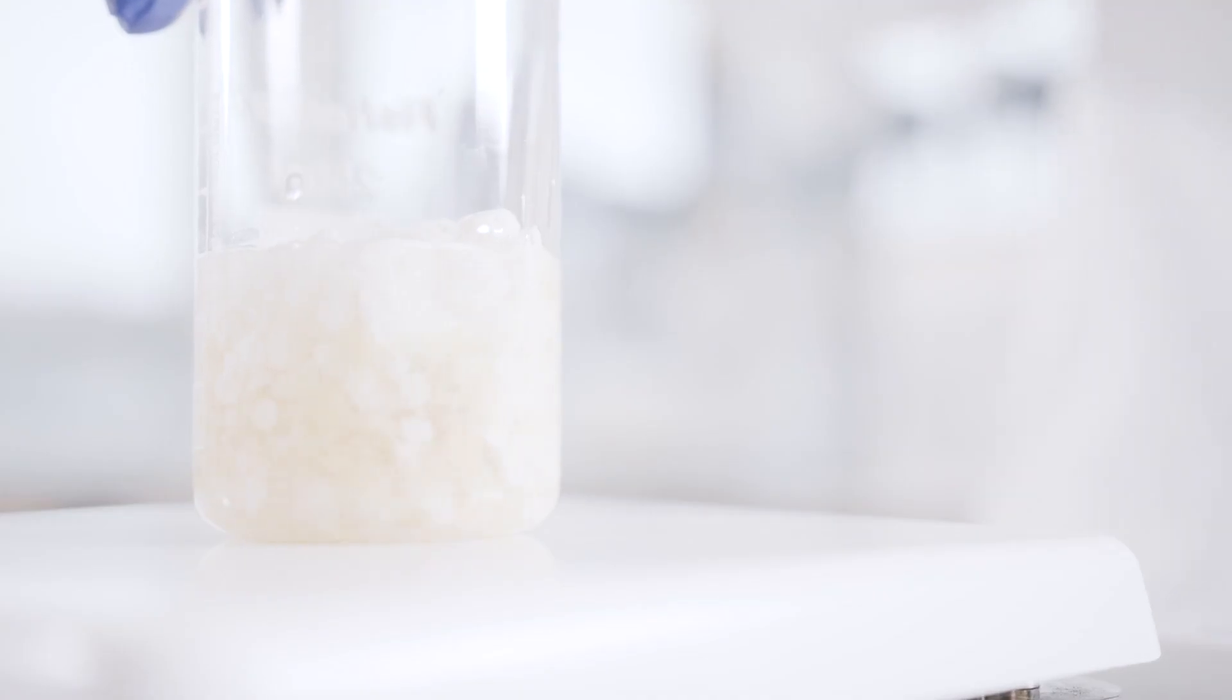We can then go on to use specialist equipment to test it, so we can use a texture analyzer and do cantilever tests and needle probe tests and the rheometer. And what those are all testing are the sensory things, the structure of it.